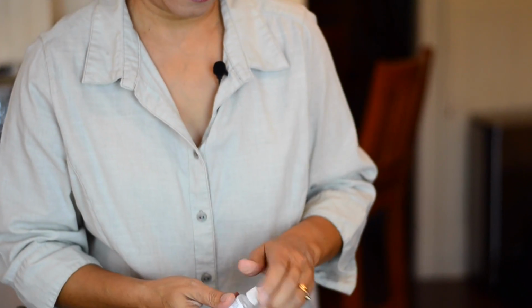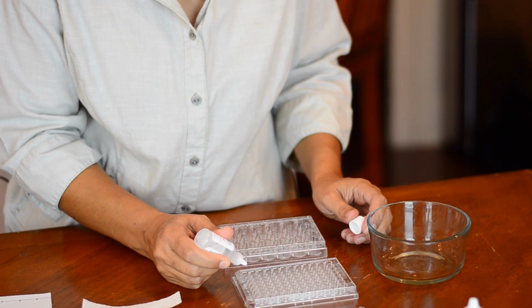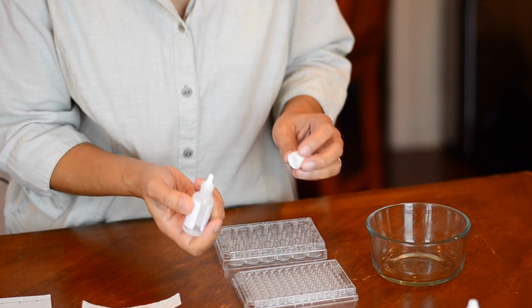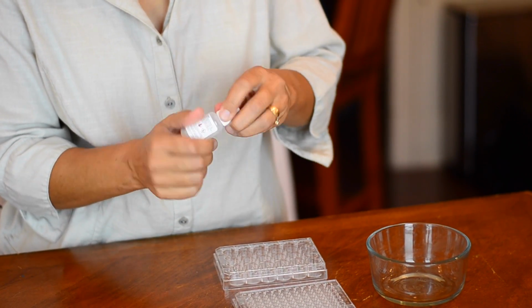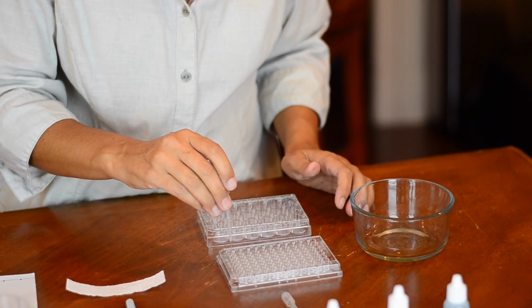That was my copper nitrate. Now I'm going to double check that I'm grabbing the right clear solution, lead nitrate, and I'm going to put 3 drops in the same well, H12. All right, that's 3 drops. Now I will use a mini pipette to stir H12 up.